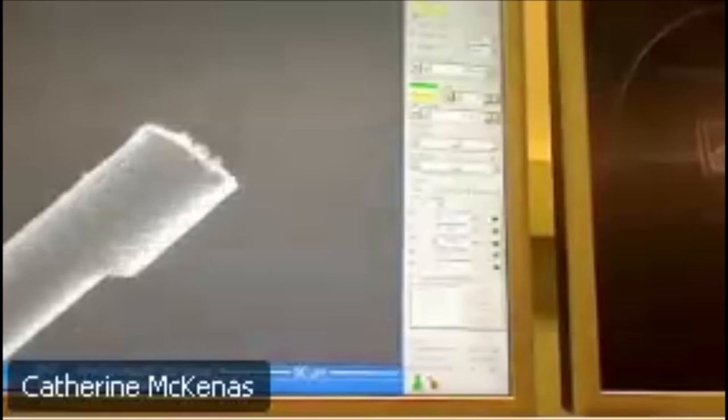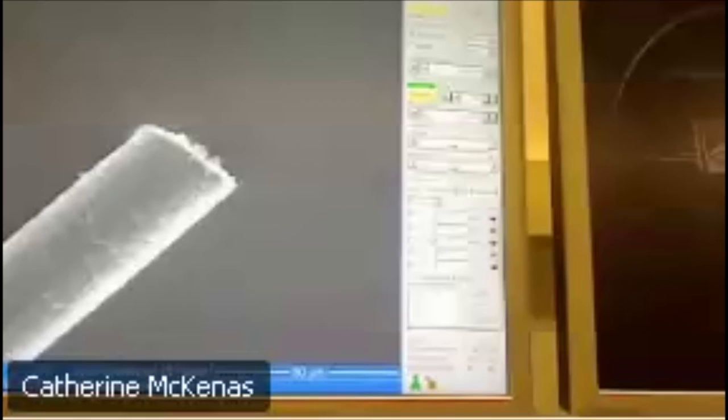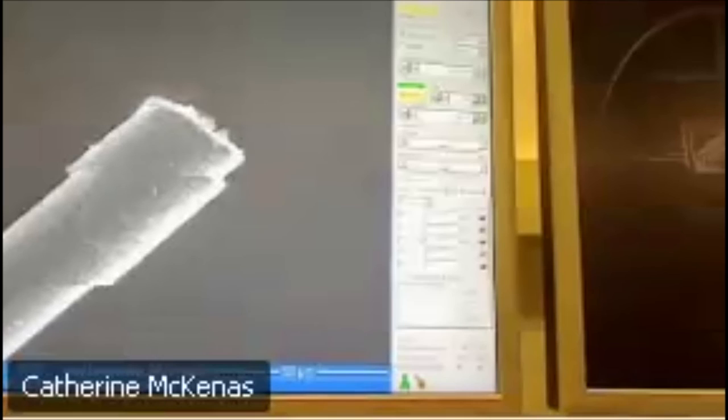Okay. So this looks like an end where you maybe cut the hair. Yeah, it looks like it. So we want to look at the other end. That tells me that the other end would have tapered off, unless you had to cut it, probably to put it up there, right? Yeah, we cut it a little bit too, actually, to put it on the sample, or on the stage. All right, so you might have two cut ends then? Yeah, that's true. Okay.